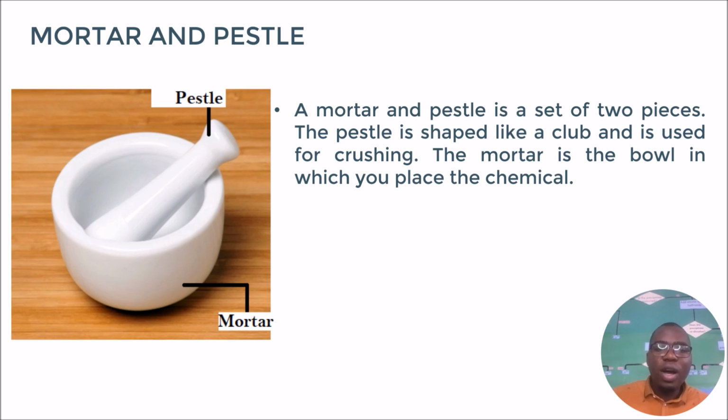We also have a mortar and pestle. Ladies and gentlemen, these things they will ask you in the exam. There are questions where they will just bring mortar and pestle and ask you to label which one is the pestle, which one is the mortar. So please take note. We have the pestle and then we have the mortar.